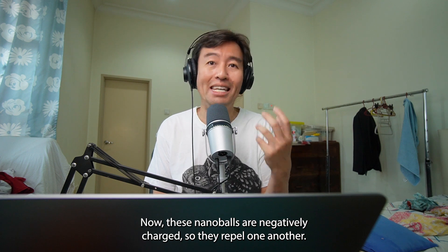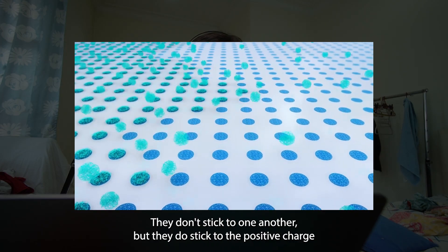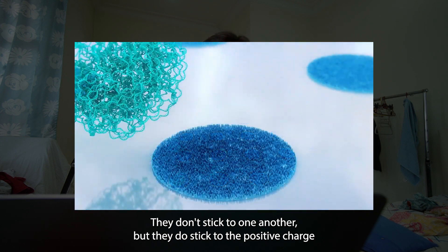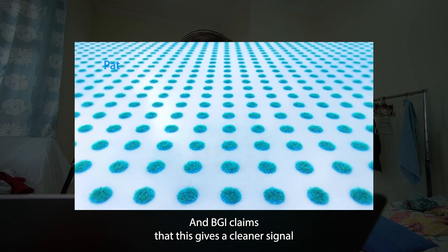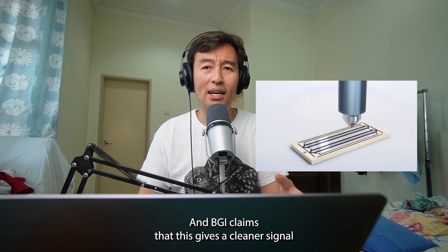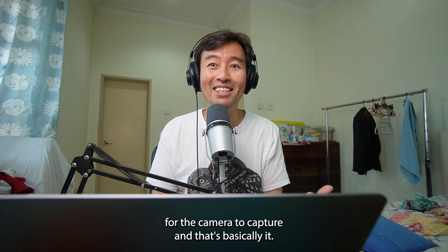These nanoballs are negatively charged, so they repel one another. They don't stick to each other, but they do stick to the positive charge that's evenly spaced out on the flow cell. BGI claims that this gives a cleaner signal for the camera to capture.